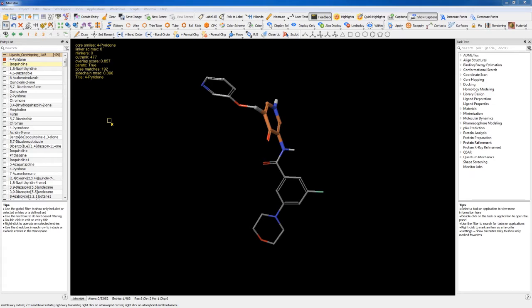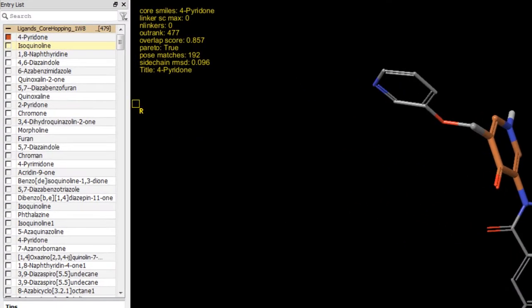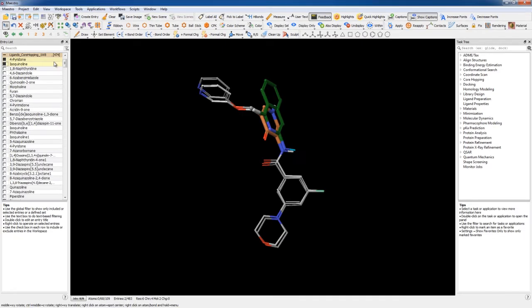Including entries should not be confused with selected entries. While inclusion corresponds to entries in the workspace, selection means choosing the entry rows which become the target for an action. To select entries, click on the title instead of the square, and notice that the selected entry is highlighted yellow. This example shows the second entry selected, but the first entry is still included. Now both are selected, and now both are also included.